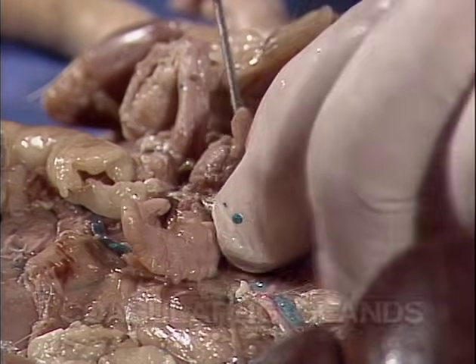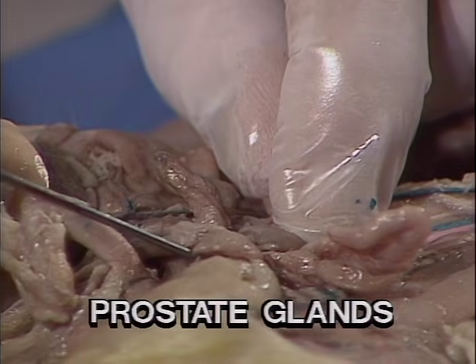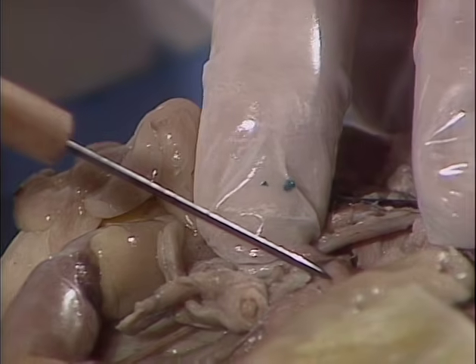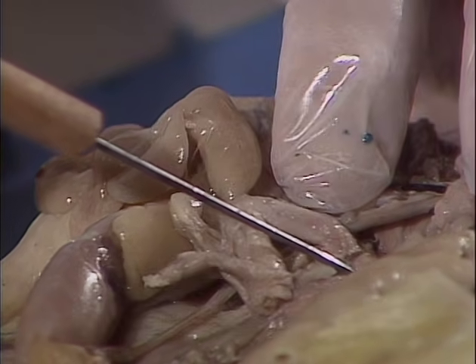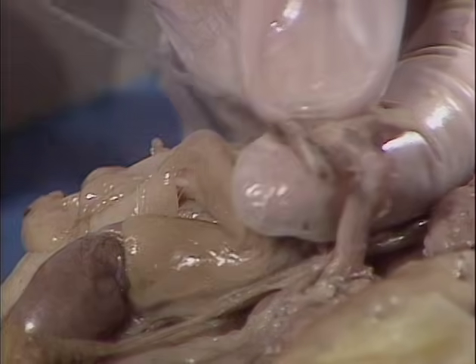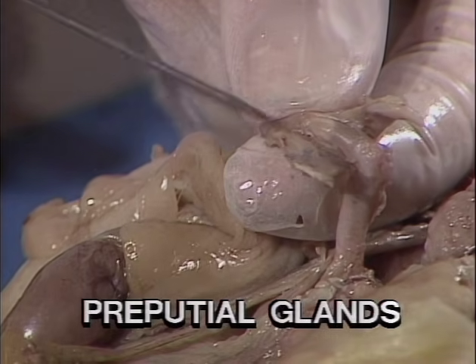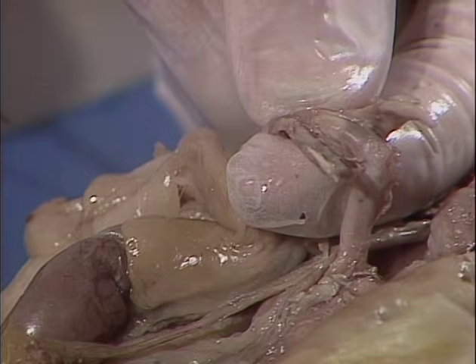Below the bladder, we see another pair of glands, known as the prostate glands. The third set of glands are located here. These are Cowper's glands. If we remove the skin from the tip of the penis, we see another set of glands known as the preputial glands. We are now ready to look at the female reproductive structures.